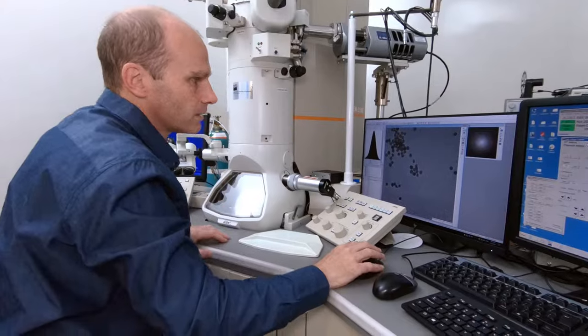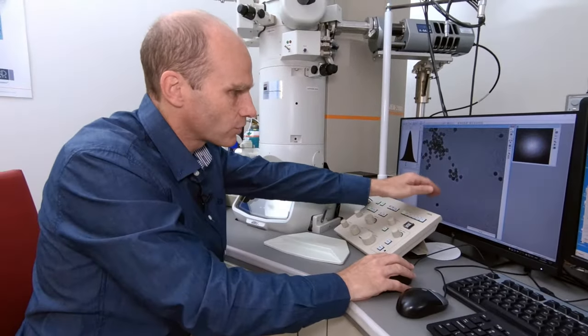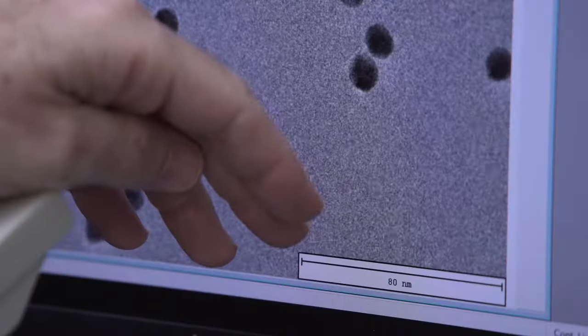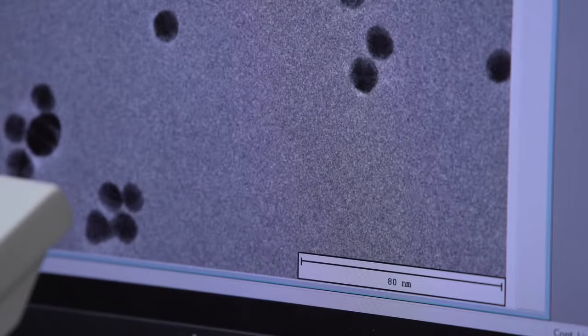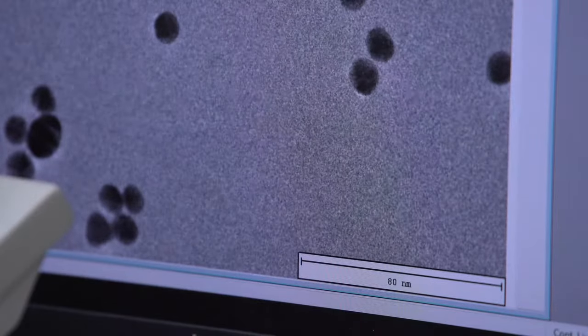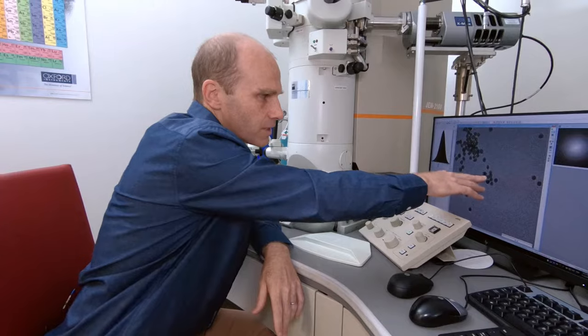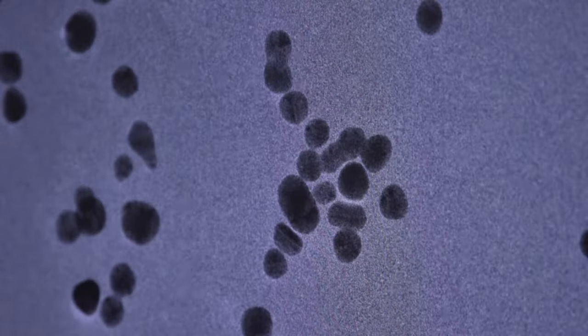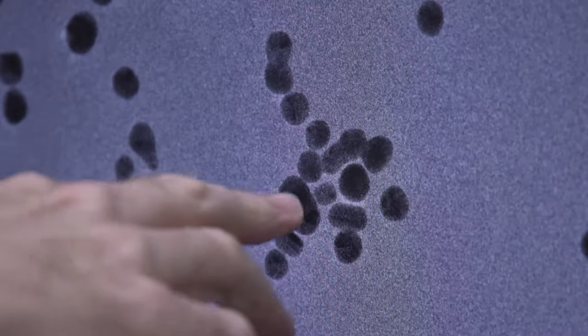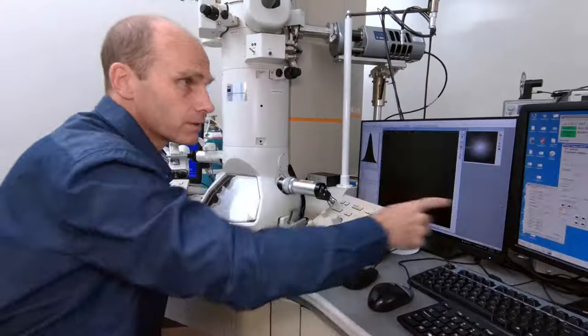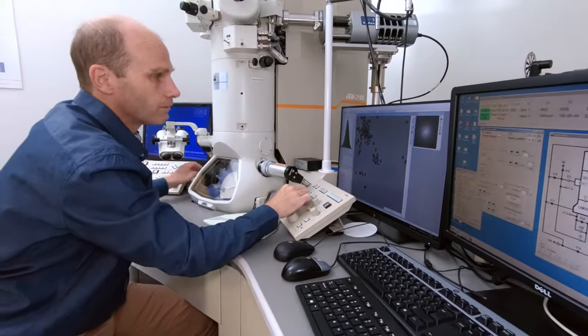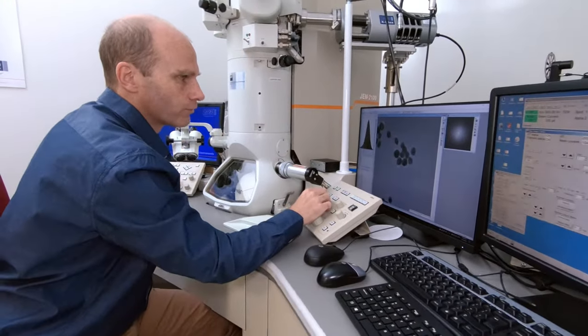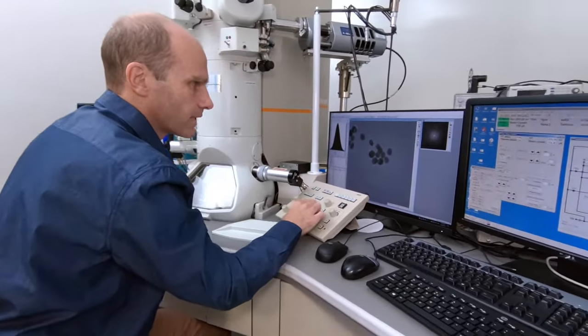We could stop there. And if we wanted to, we could measure out the size. A scale bar down the bottom is indicating that's an 80 nanometer scale bar. So again, these will be around about 5 to 10 nanometers in size. And you can see the shape of them. You could go ahead and make a size distribution and work out some of the statistics or the information about your sample. So currently we're sitting at about 80,000 times magnification.